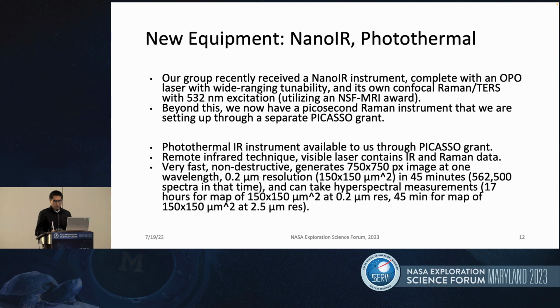So just to talk a little bit about that new equipment that we also have beyond this, we have acquired a new nano IR instrument with an OPO laser and a confocal Raman TERS with 532 excitation, thanks to an NSF MRI award, as well as we're setting up a picosecond Raman instrument facilitated by a separate Picasso grant.